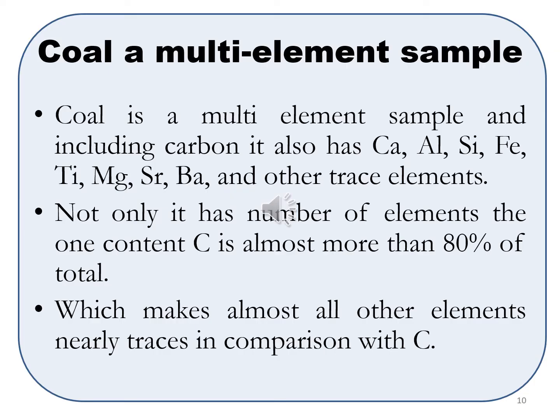Now coal is not just a multi-element sample. One element, carbon, has a content of almost more than 80% of the total, which makes all other elements nearly trace in comparison with C.